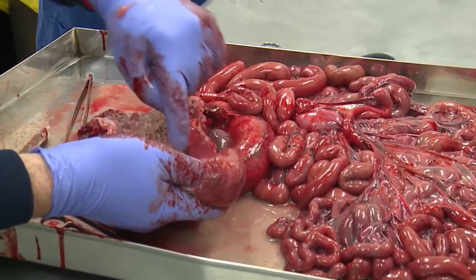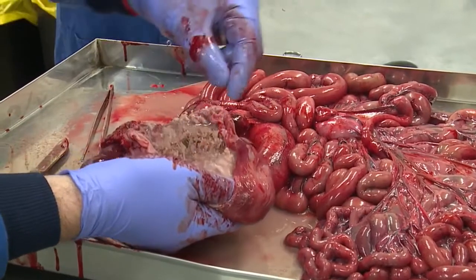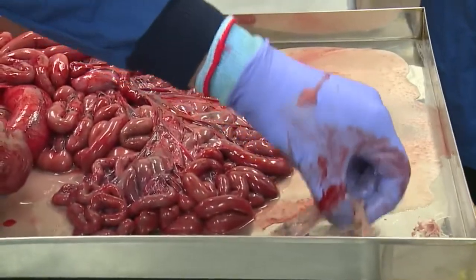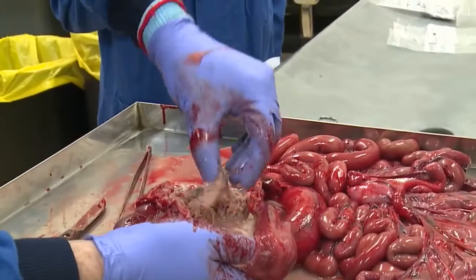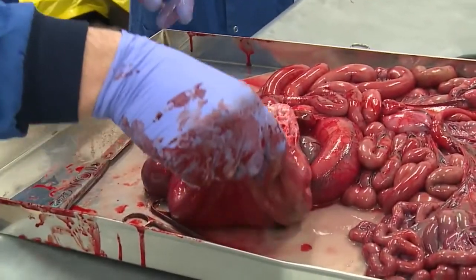Just some bones, this beige digester, and then this fish, which, well, I presume it's a teleost fish, has got some flesh adhering to it. So again, this is all consistent with an animal that's been recently feeding.